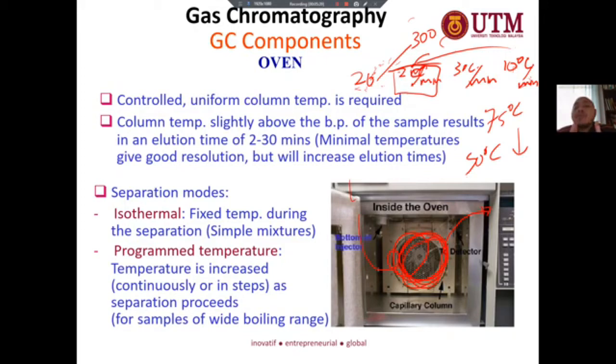We want the analytes to be able to separate, but not take too long, because we don't want the analyte peaks to be broadened. So we want to keep the conditions optimum, so you can have very good resolution, but at the same time the retention time is not that long.